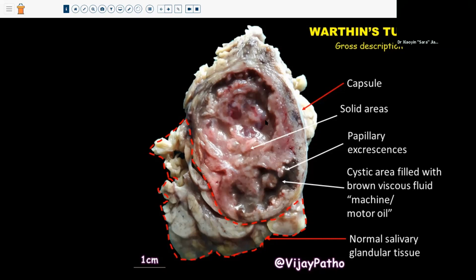And this is a good time to talk about an approach to grossing of salivary tumors. You want to definitely sample these thoroughly. They have a range of microscopic appearances, rather, that can be quite challenging if you don't get good sampling. So really sample these thoroughly.